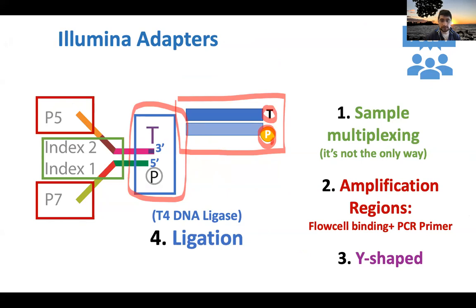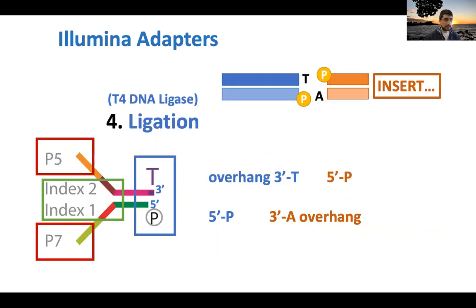Restriction enzymes. So this is all right. So Karina said A-tail oligos. That's a good start. It's actually not sufficient, but it's a very good start. So your fragments need to be A-tailed. In this case, you have something that is complementary to the T overhang. That's really good. However, there is one more thing that is really important, and without it, you will not be able to perform ligation. And that is that you need a 5' phosphorylation.